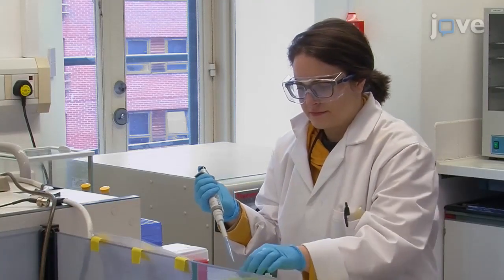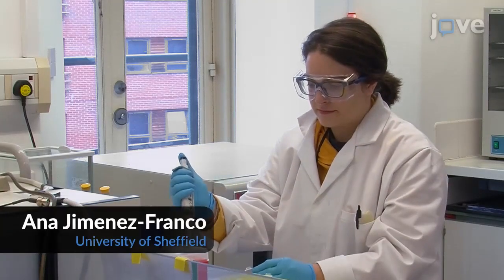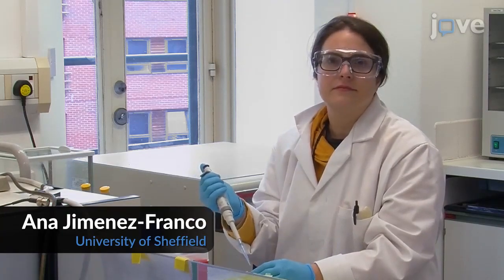The person demonstrating the procedure will be Ph.D. student Emma Hermannis Renko from my laboratory.